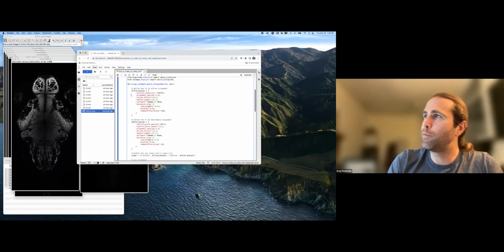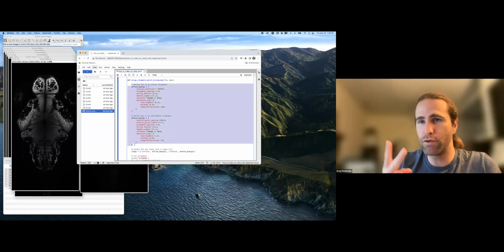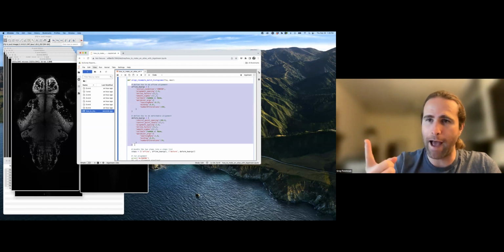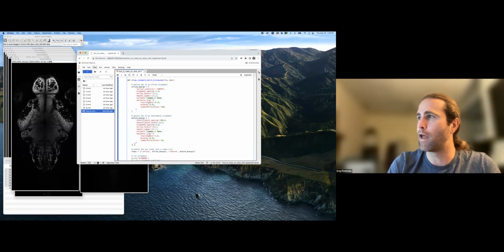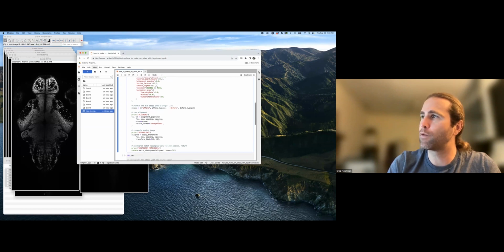So I've shown BigStream in how-to videos or how-to presentations before. This is parameterization of a 2-step image registration that performs an affine alignment followed by a deformable alignment. Those 2 steps are bundled together into this steps list that BigStream uses. So we're telling BigStream, I want you to do an affine alignment, and then I want you to follow that with a deformable alignment afterwards.